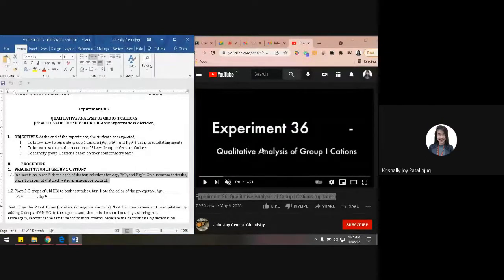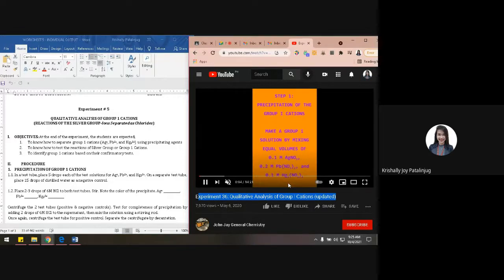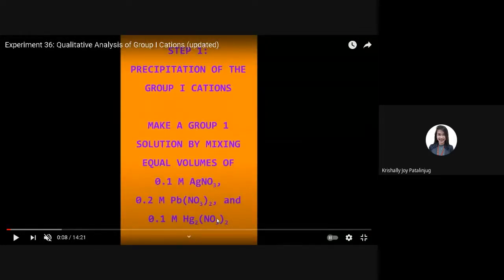What she is reading will be demonstrated in this video. As you can see, the test solutions used for silver, lead, and mercury 1 are all nitrate test solutions.